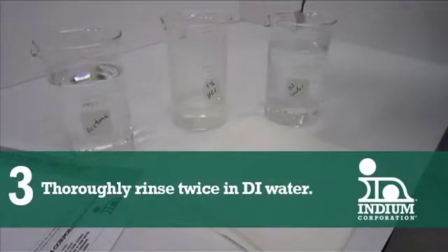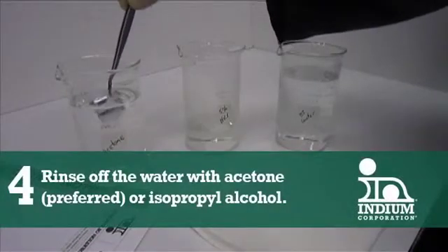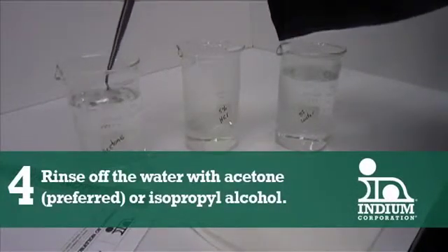Number three: thoroughly rinse in DI water. Number four: rinse off the water with acetone or isopropyl alcohol.